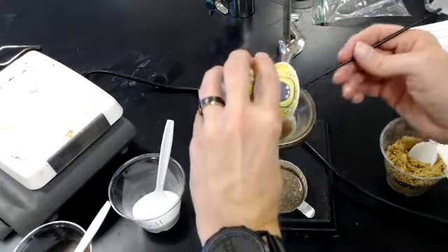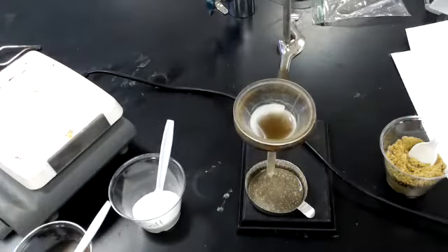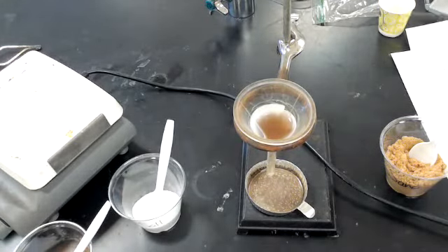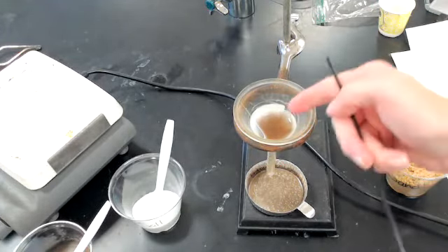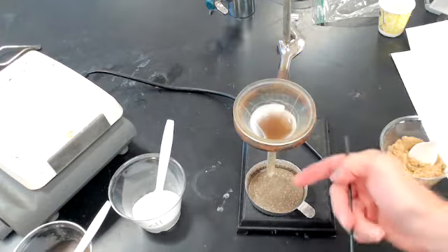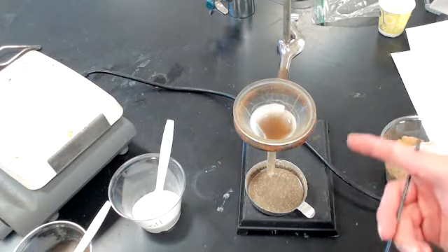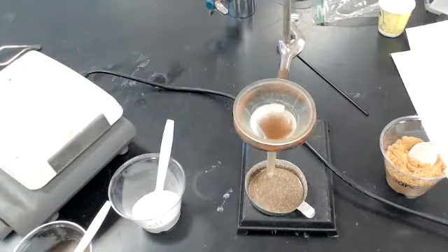I'm actually very close to having that. I'm getting the final little bits of, okay. There we go. I have cleaned out my cup. I'm actually done with my cup. I'll throw that away later. And everything that was in my cup now is here in this filter. The filter is probably going to catch something, and it's probably not going to catch something. This is a separation technique going on here. Okay. So we are going to sit around and wait for this to filter. It's going to be oh so much fun. We'll actually be done in a few minutes, but if you want to jump ahead in the video for a brief amount of time, that's probably just fine.